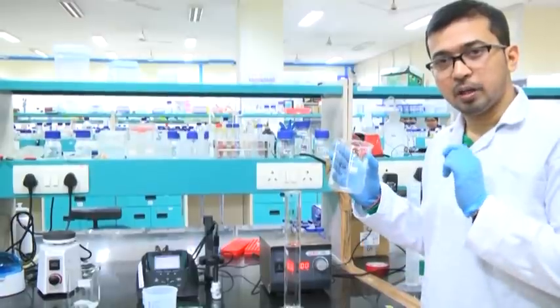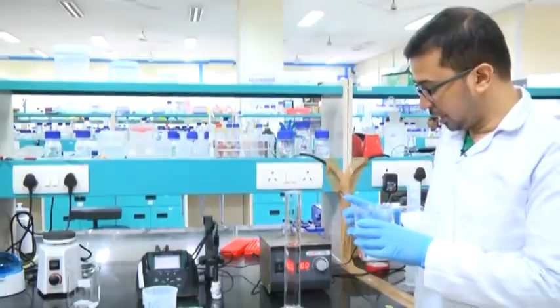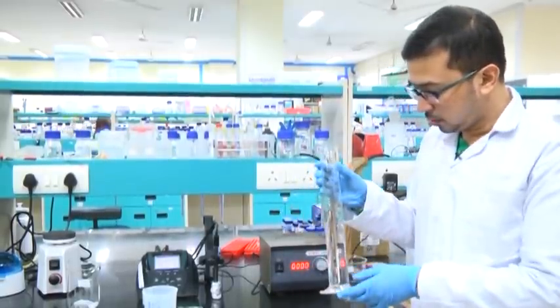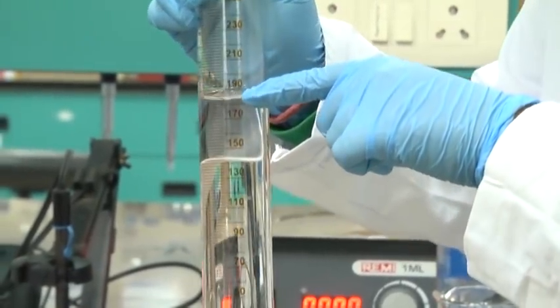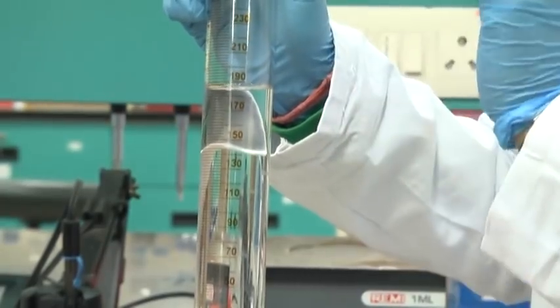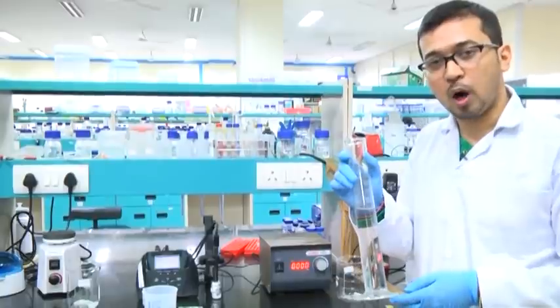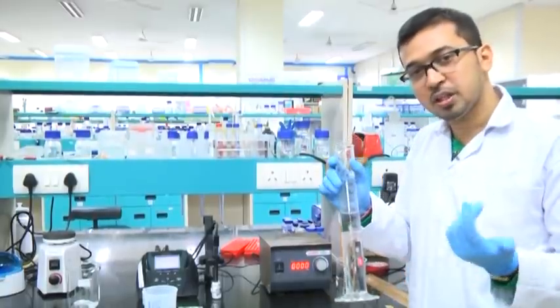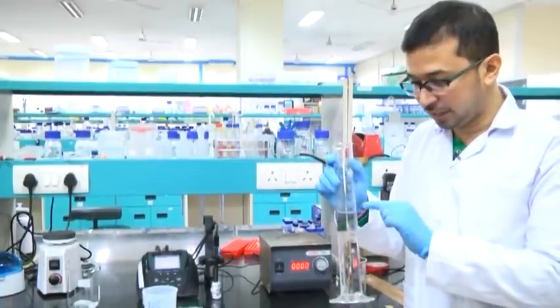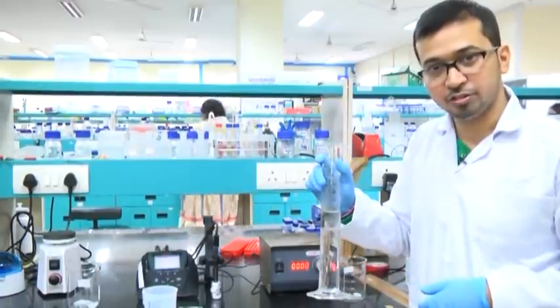I have completely transferred this solution from the beaker to the measuring cylinder. One interesting thing to note is that the volume here is less than 190 ml — we can see the meniscus is close to 190 ml — however, we had added around 200 ml. So the graduation in case of a beaker is not accurate; in the measuring cylinder it reads 190 where the beaker showed 200. Better to use the measuring cylinder.